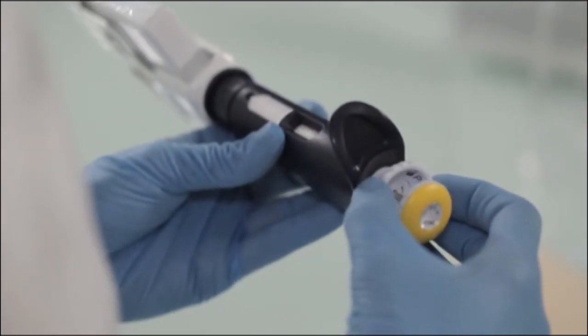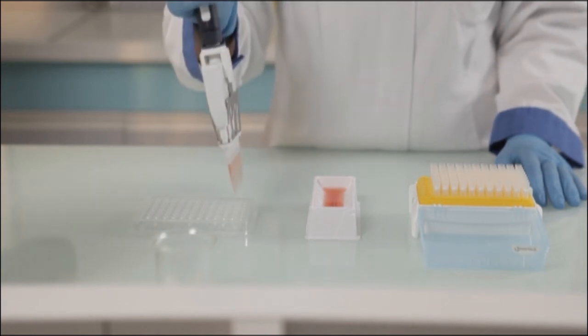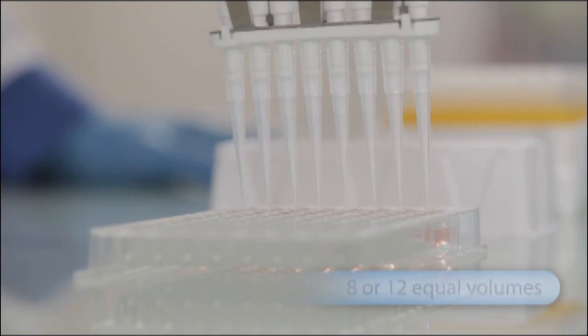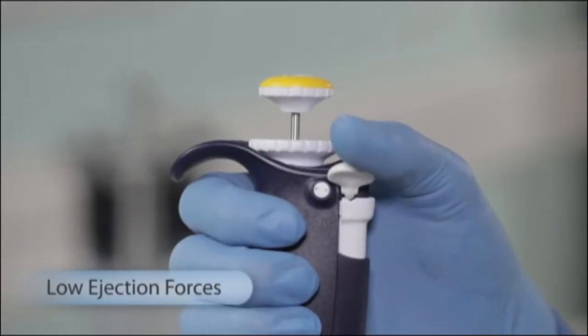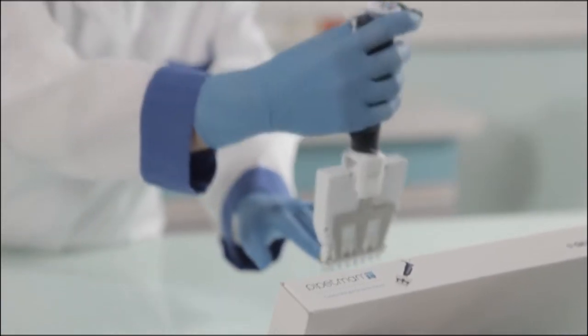This multi-channel pipette has an exclusive piston drive mechanism to secure results with no disparities of the dispensed volume and to decrease pipetting forces. The tip ejection forces are also reduced thanks to a unique ejector spacer.